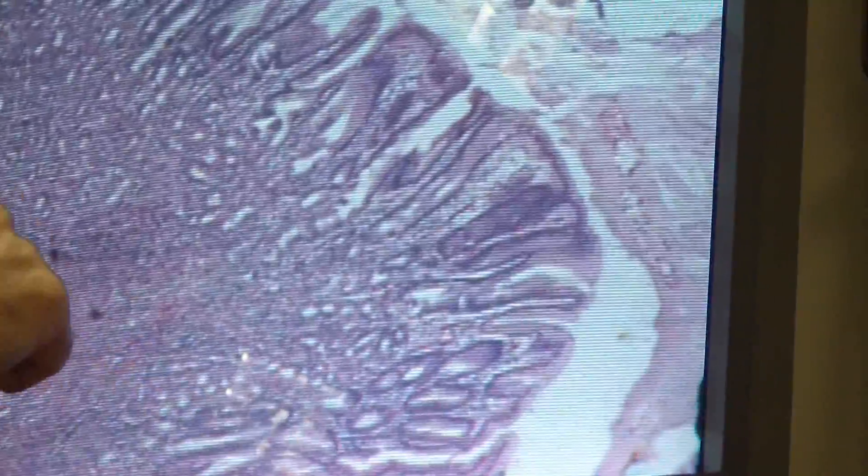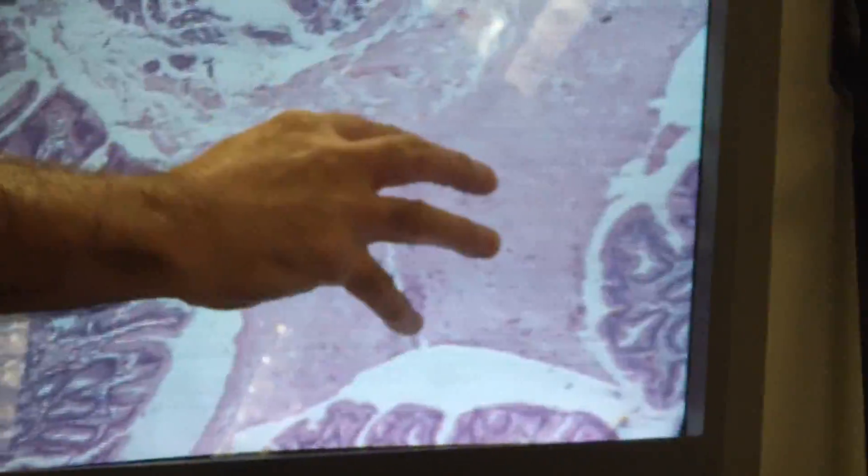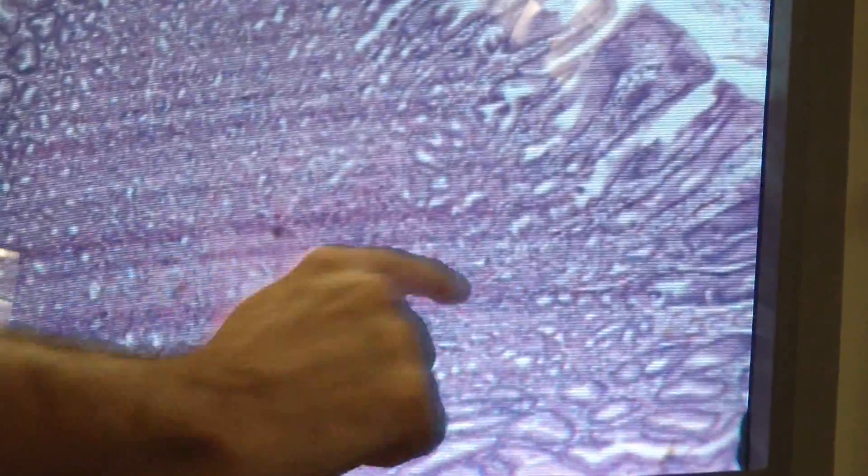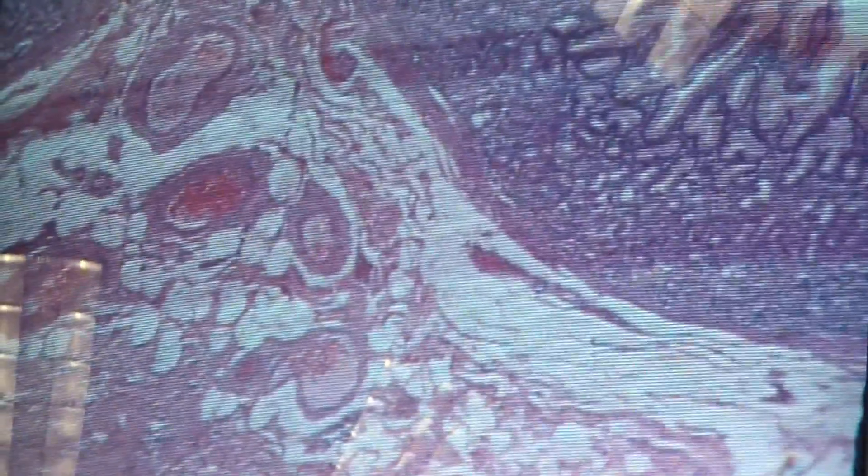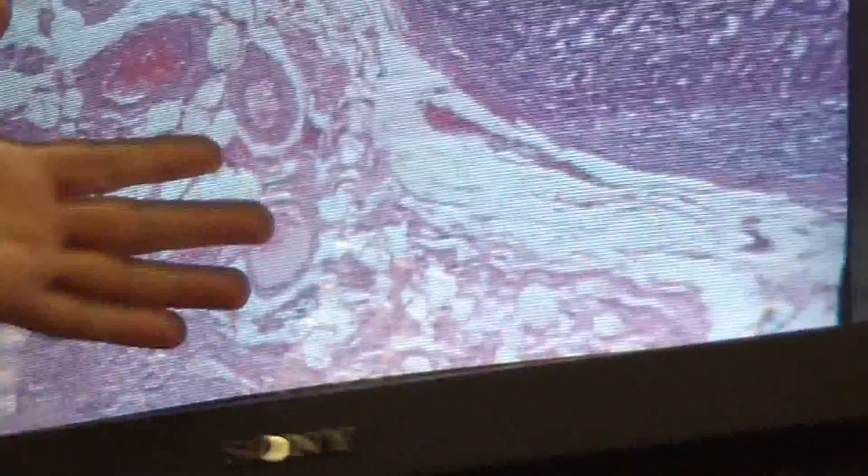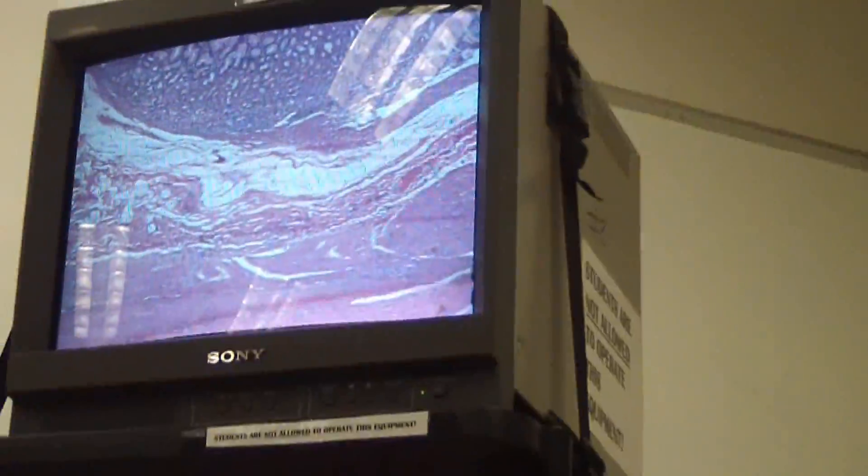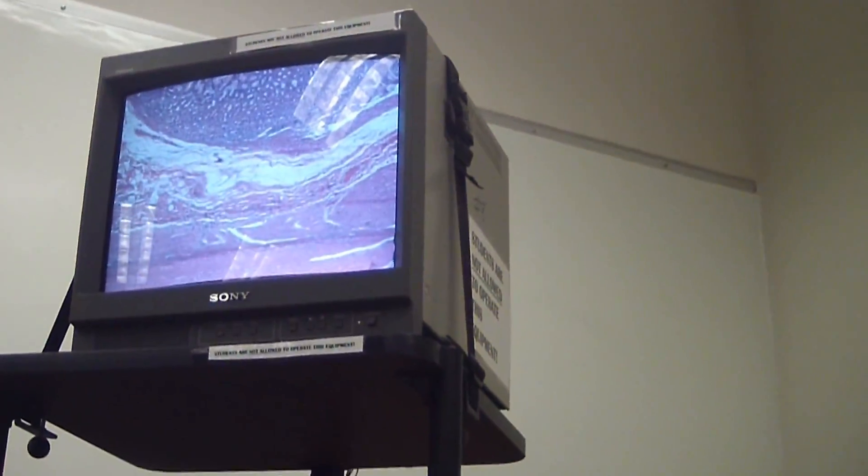From here to here, this is part of lumen. From here to here, that's the mucosa. This is the submucosa. What is submucosa? Arteries and veins, connective tissues. You see all these little foldings right here inside this connective tissue? See this? Those are rugae. Remember inside the stomach we have all those rugae right here.